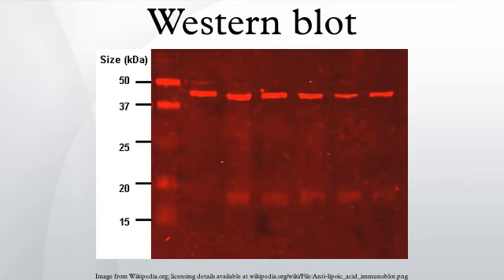Secondary probing. One major difference between nitrocellulose and PVDF membranes relates to the ability of each to support stripping antibodies off and reusing the membrane for subsequent antibody probes. While there are well-established protocols available for stripping nitrocellulose membranes, the sturdier PVDF allows for easier stripping, and for more reuse before background noise limits experiments.